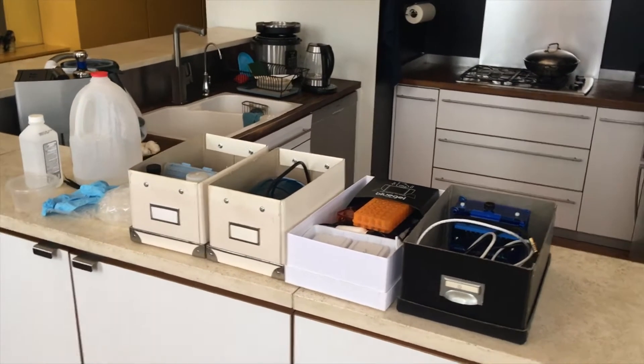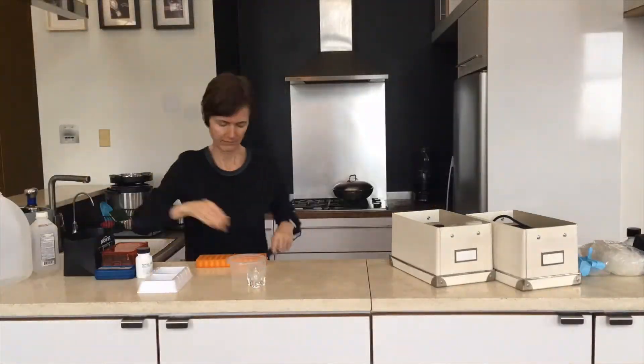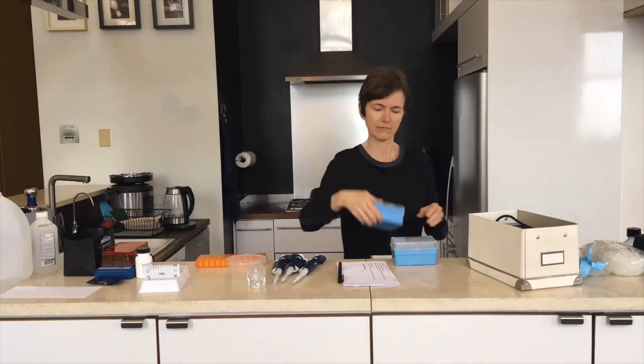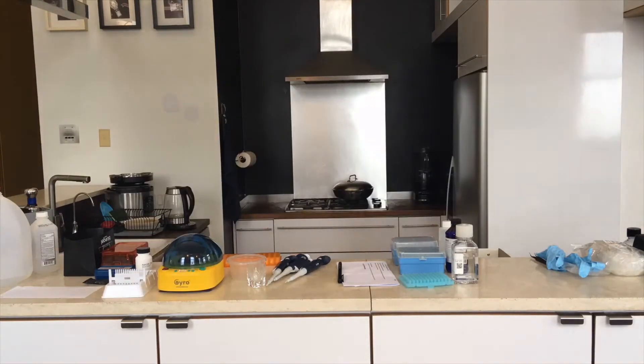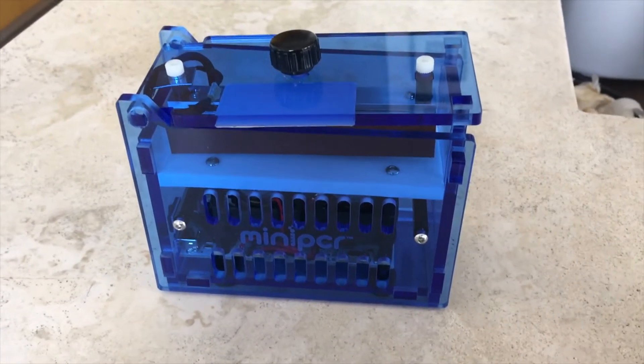So this is what things look like when I put them up on the counter. All right, let's talk about hardware.